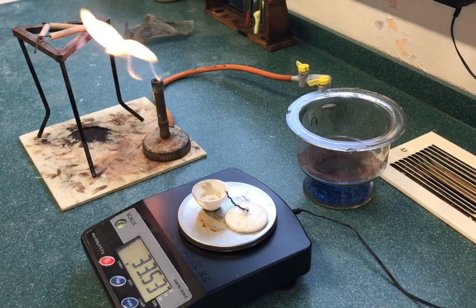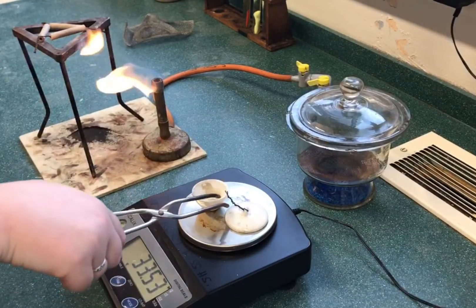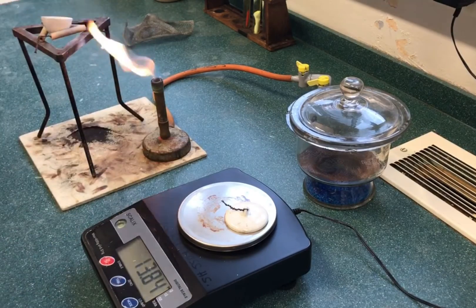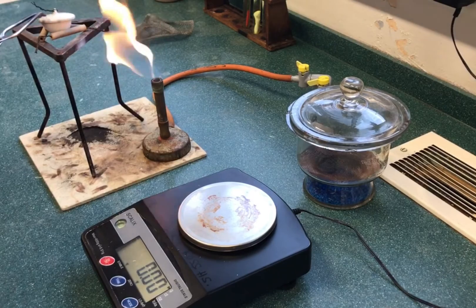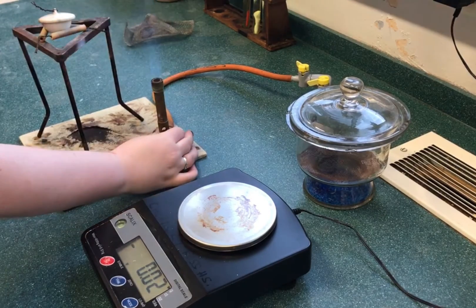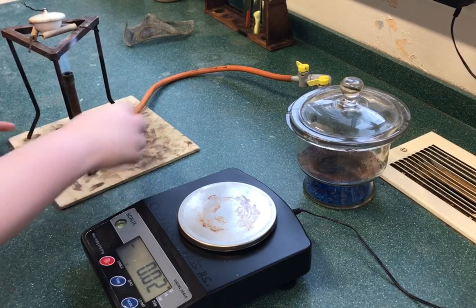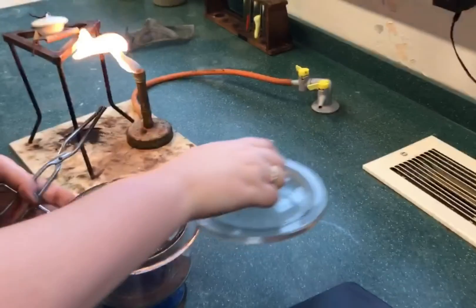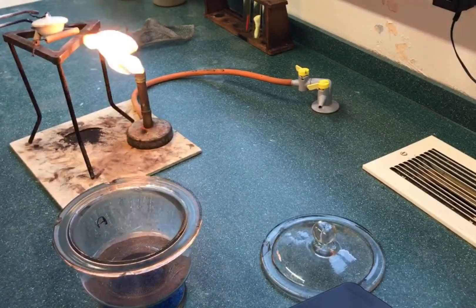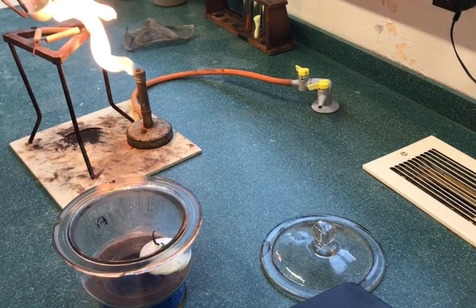The new weight is noted and the crucible and lid are once again heated strongly for around 5 to 10 minutes on the blue flame of a Bunsen. After the heating process, the crucible and lid are allowed to cool once more in the desiccator before being weighed again.